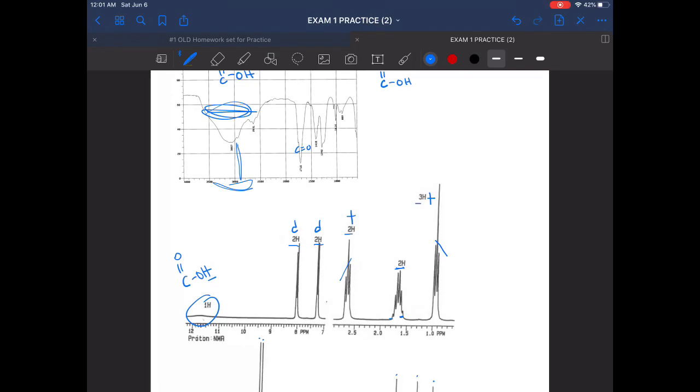Now, something that I always gravitate to early is this 7 to 8 region. You notice they cut everything out between 3 and 7. That's because there's nothing there. So if you see portions cut out, that's why. It's not tricking you. It's not hiding from you. It's flat. There's nothing there. 7 to 8 is a big deal.